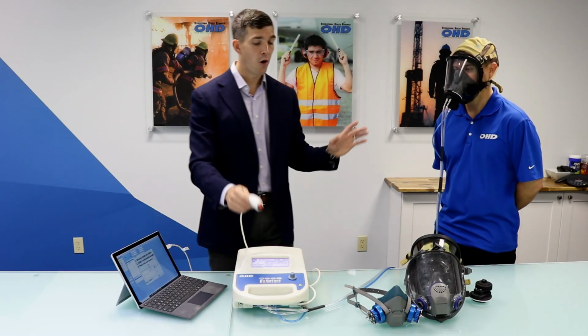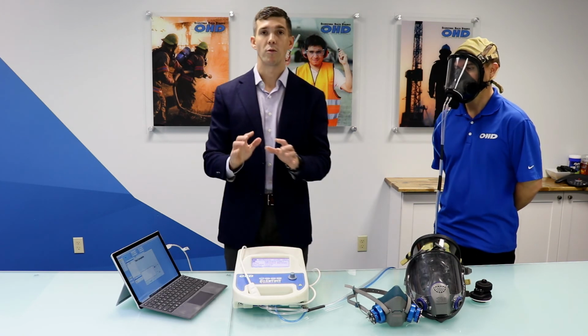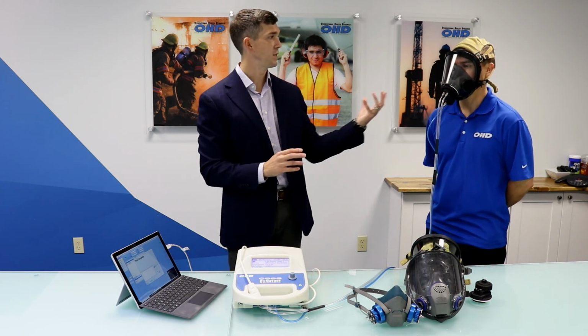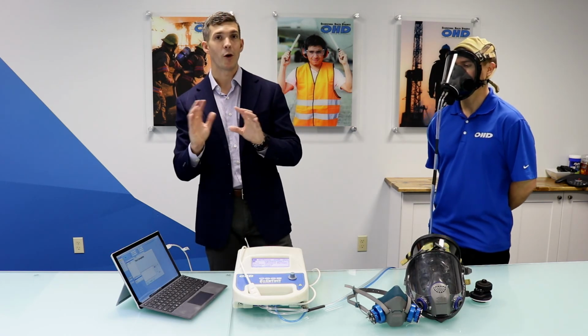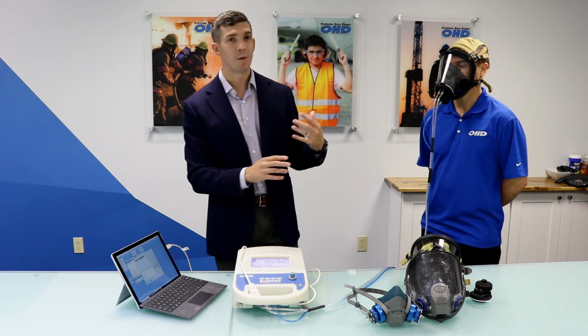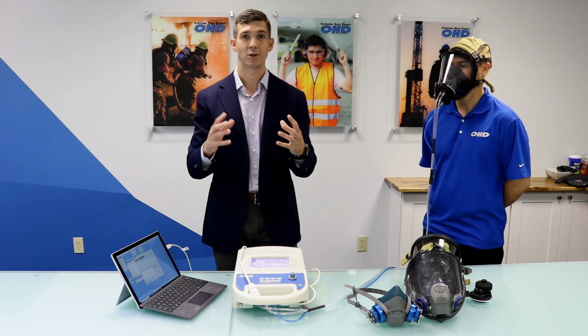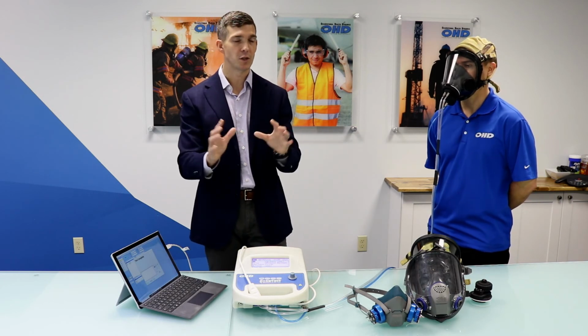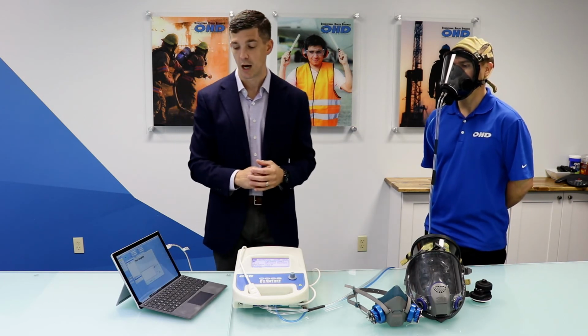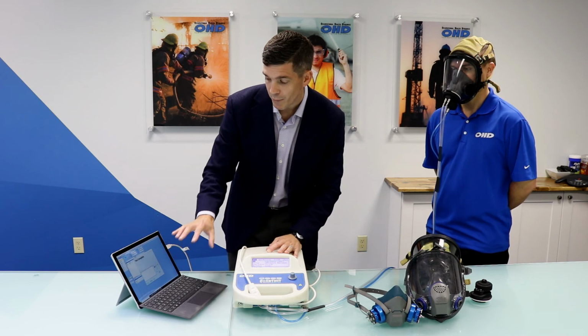So overall, hold tight for me, Stephen. Overall, great fit test there. Obviously the mask fits well. Obviously Stephen's trained well. He knows how to get the mask on properly. Again, what we looked at earlier was we made sure when he came in, he did his fit testing exercise before all the requirements. Facial hair was checked, all of those things, but Stephen did a fantastic job. So that was a pass test.